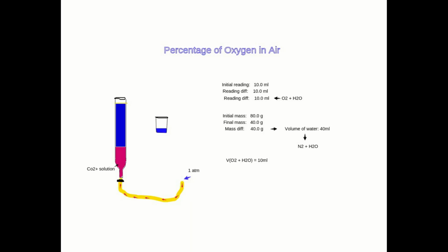Now the experiment is over, and we have a collection of data. The first data is here, the volume of white oxygen, which is 10 milliliters. And besides, because of today, the pressure of the atmosphere is 725.8 millimeters of mercury, and the pressure of water vapor is 20 millimeters of mercury.